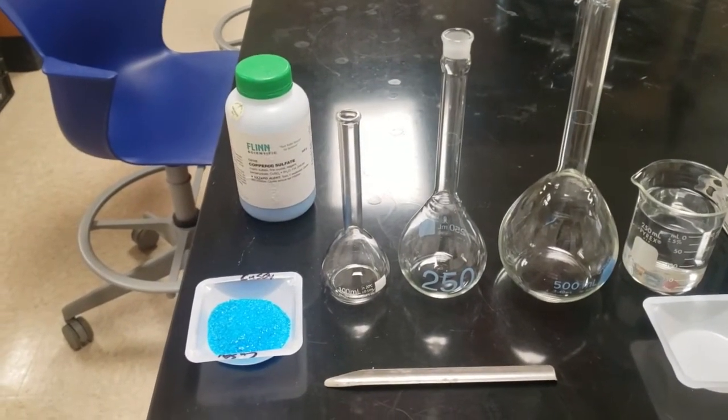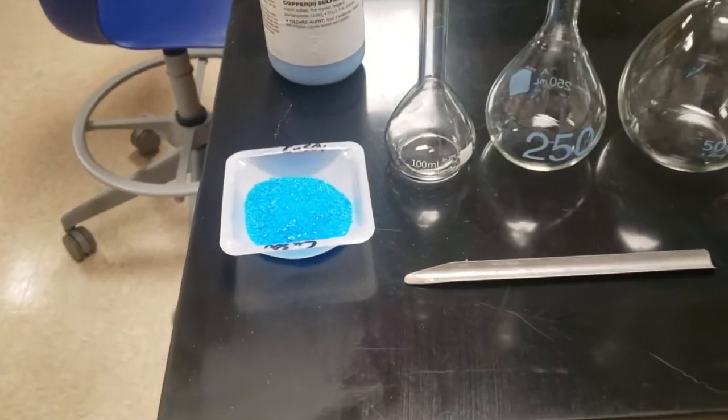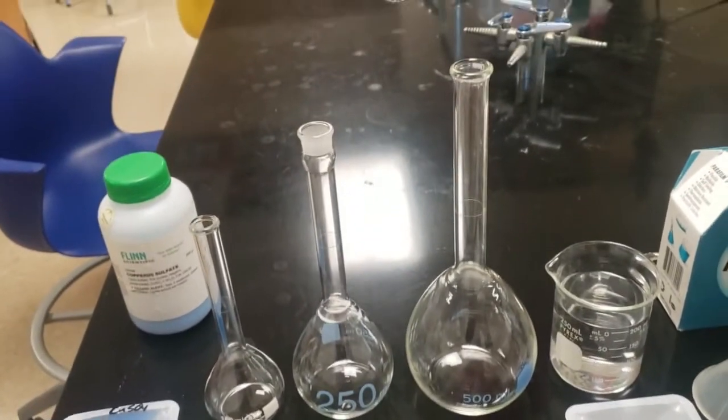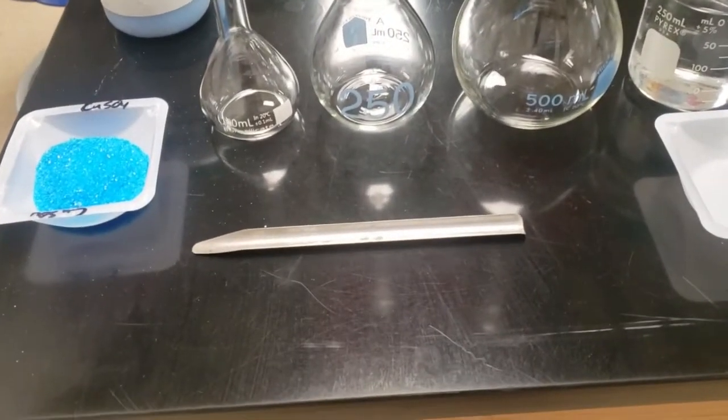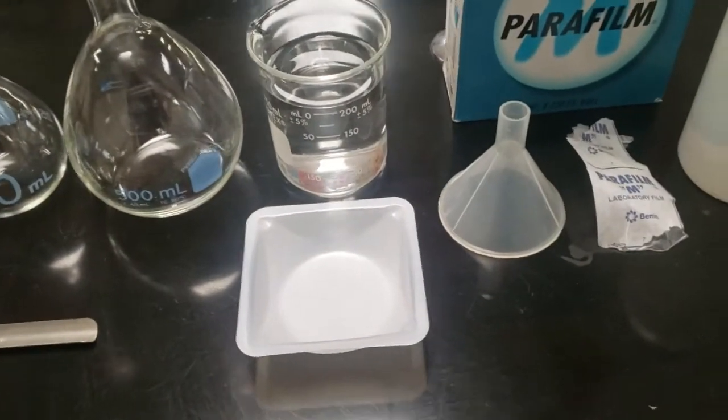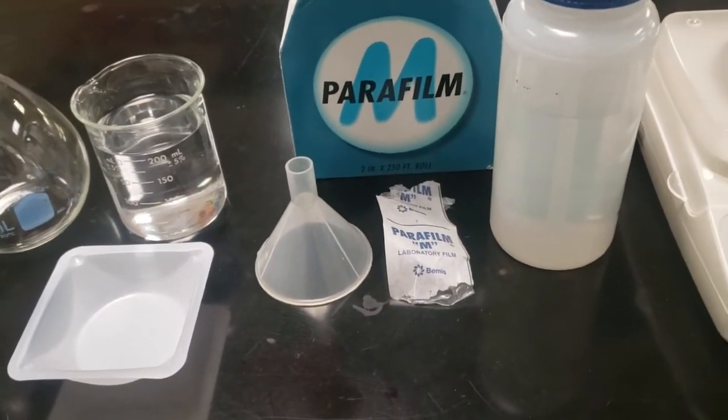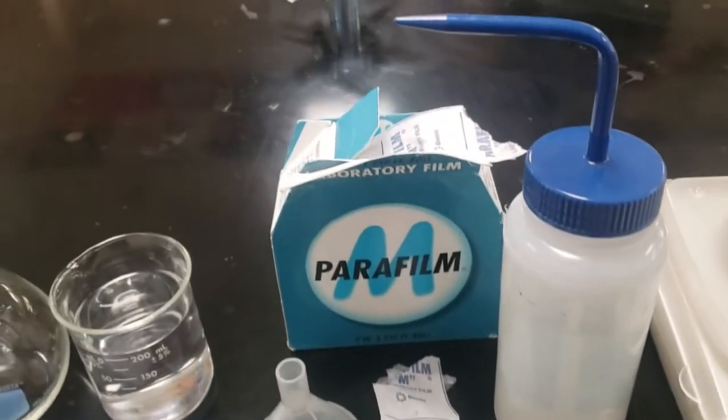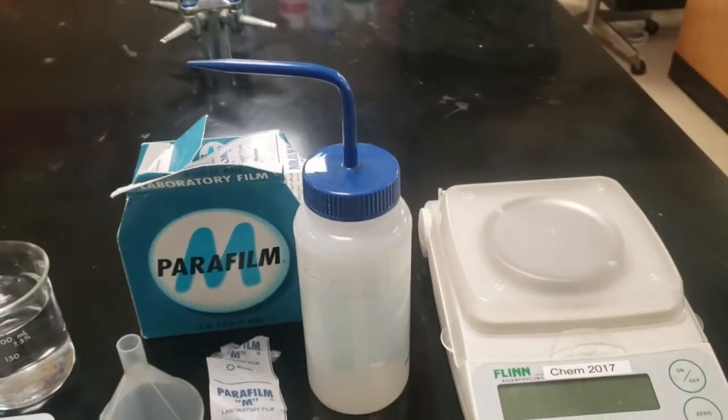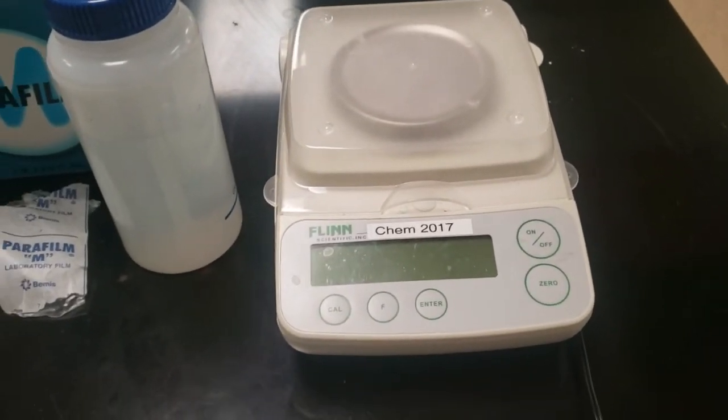Here we have our tools for this lab. We have the actual chemical in a weighing boat. We have three different volumetric flasks. You'll use one of them. You'll be assigned. Here's a scoopula. It's great for digging things out and scooping things up. Here's an empty weighing boat, 250 milliliter beaker of distilled water, a powder funnel that has a big hole in it, a piece of parafilm - you need to take the paper off for it to work - and the blue top is distilled water you can squirt with. Lastly, we have an electronic balance.